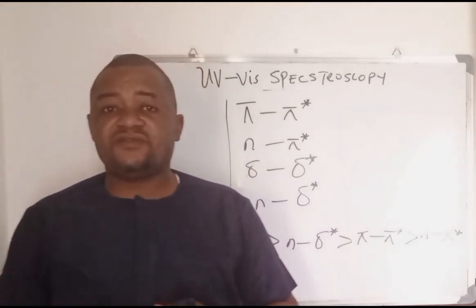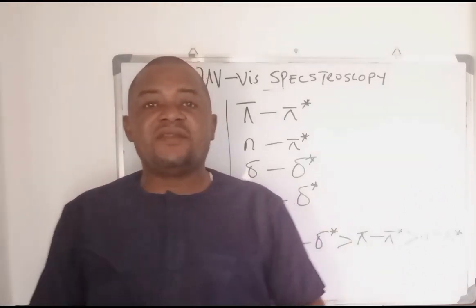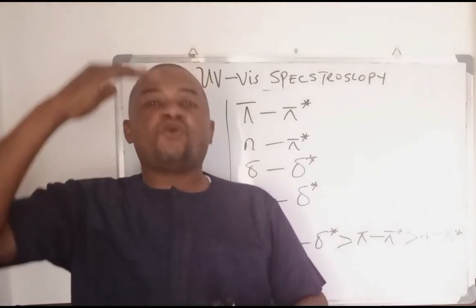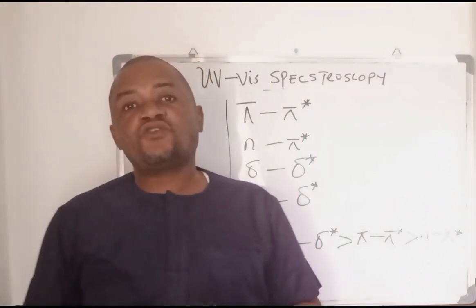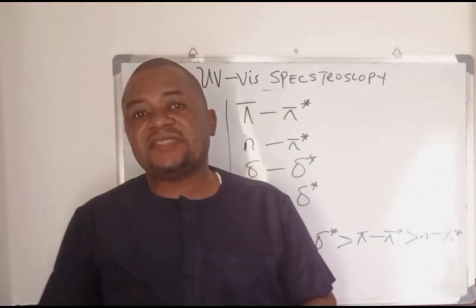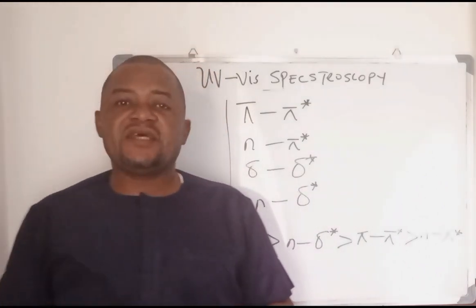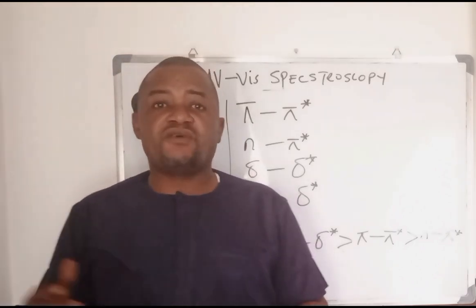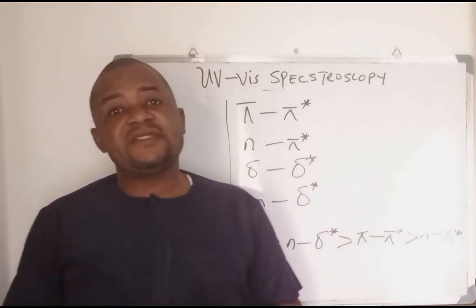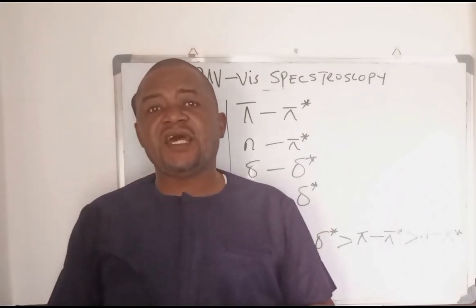And when it acquires that particular radiation, there is going to be a vibration in the substance's internal structure. This vibration will allow those particular electrons at the lower energy level to absorb the UV radiations and get themselves excited to the next, higher energy level. And when that happens, there could also be a corresponding transmittance at the end of the day. So when that happens, there is absorbance, and that absorbance is what is connected to the detector that will possibly give you signals which form a spectrum. And at the end of the day, you can use the spectrum, because of the absorbance that is measured and the corresponding wavelength, to get figures or data that can aid you to interpret, characterize, analyze or detect different types of molecules.